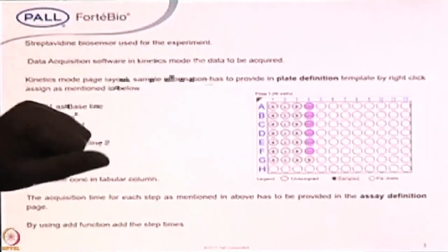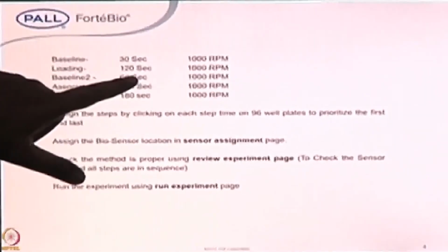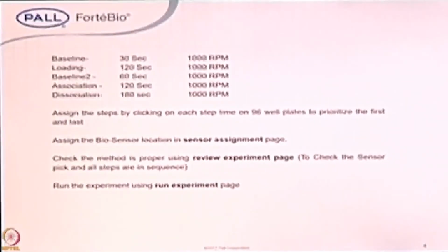And these are the concentrations, very simple. I'm taking around 30 seconds as my baseline time, and then 120 seconds to look at the loading, how much load happens. The software is compatible: when you are doing the acquisition itself, you can extend for some more time if you want, or if you see that saturation happens, you can jump to the next step. Yes, that is also possible.